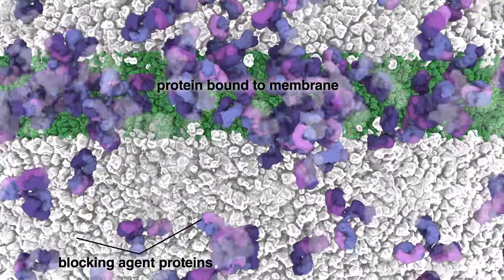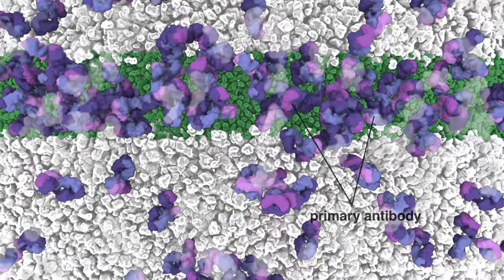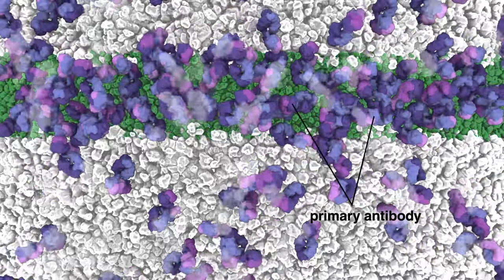After blocking, the membrane is then incubated in a solution containing blocking solution and the primary antibody that specifically recognizes the protein of interest.